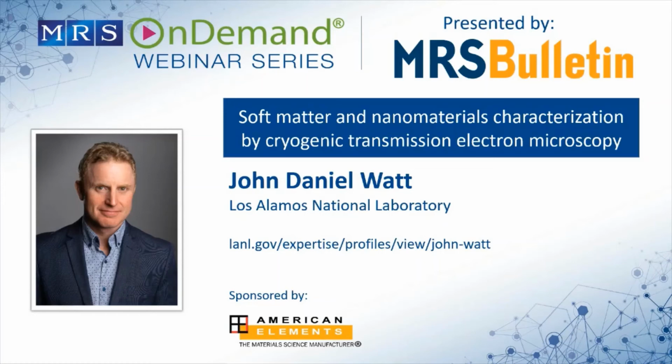Okay, and that probably relates to another question that someone else has submitted here, relating that to the possibilities and challenges for doing elemental analysis during cryo-EM, because in most cases these days when we think about elemental analysis, we'd be doing that in STEM mode. So could you give some comments on the possibility of doing analytical work in cryo-STEM beyond the issues of damage?